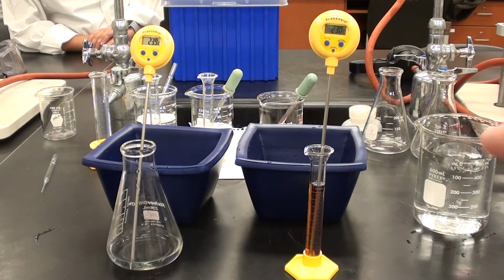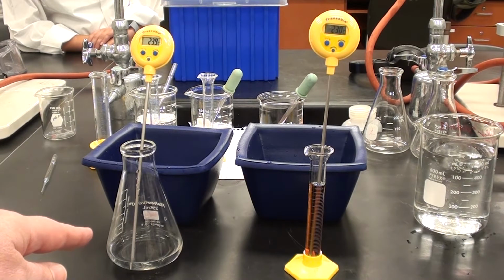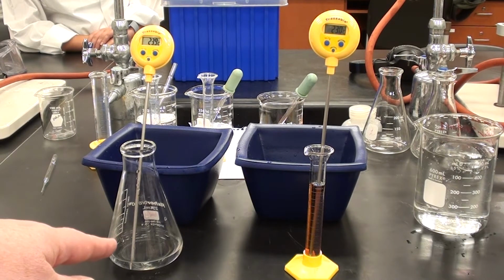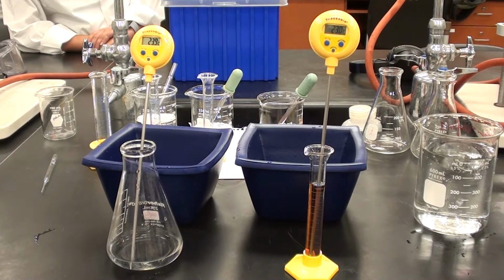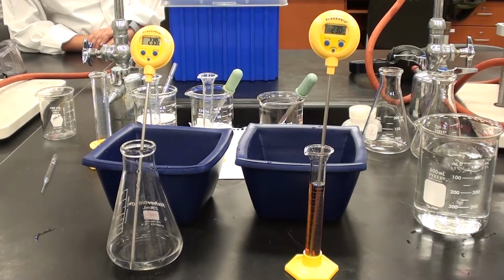So what we've got is the iodine solution, 10 mils here, and in this one we've got 20 mils of water, 10 mils of HCl and 10 mils of acetone. So what we're going to do now is put these into the buckets. Would you please do that?